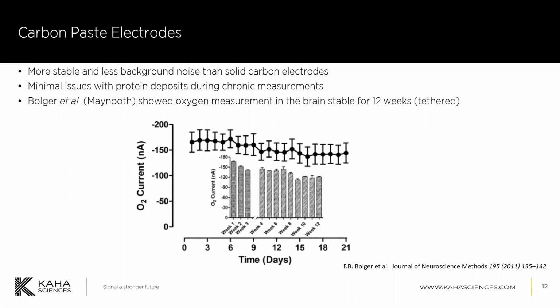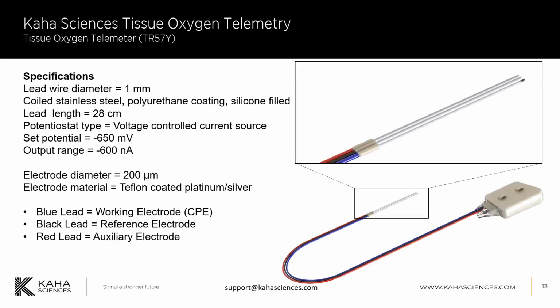In fact, the team at Maynooth showed that oxygen measurement in the brain is stable for 12 weeks after the implantation. Now, this is in tethered animals, and the Kaha Sciences team, or the predecessors to that, the telemetry research team, got together with the team at Maynooth to develop a tissue oxygen telemeter.